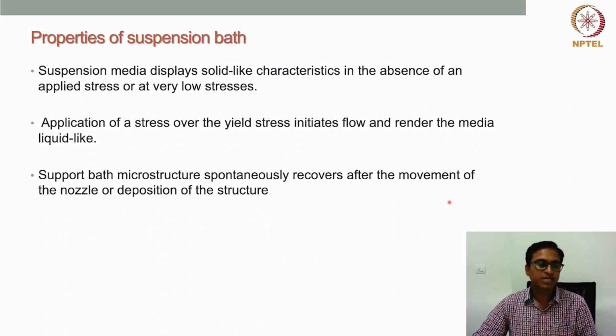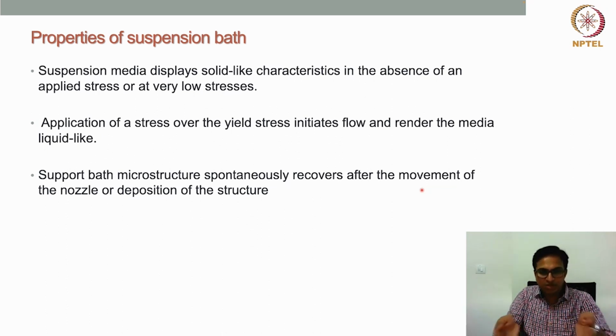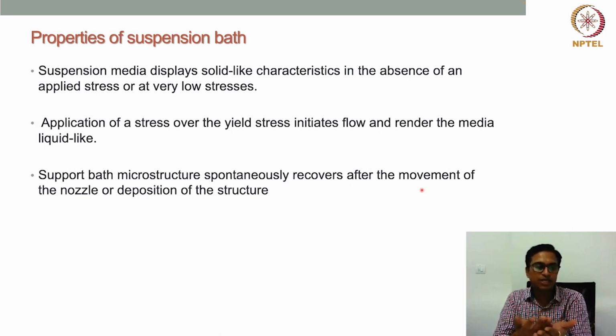Another important property is the self-healing property of this suspension bath or support bath material. That means the support bath microstructure spontaneously recovers after the movement of the nozzle or deposition of the structure. That means when the printing is done, the deposition is done, at that time the support bath microstructure will again come back to their original position, and they will encapsulate the printed structures, and then again they will behave like a solid, and they can provide support to the printed structure. So these are the important properties of support bath.